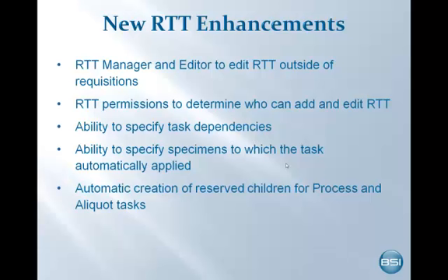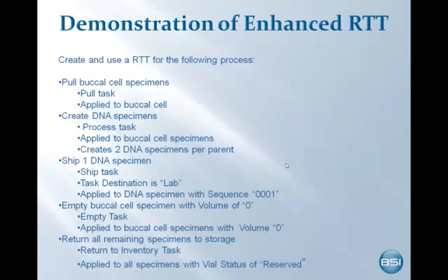New enhancements to Requisition Task Templates include the addition of a separate template module with a manager and editor, permissions for who can add and edit templates via this module, the ability to specify task completion dependencies, the ability to automatically apply tasks to specified specimens, and automatic creation of reserved children specimens for Process and Aliquot tasks. Shortly, I will demonstrate the creation and application of a Requisition Task Template.